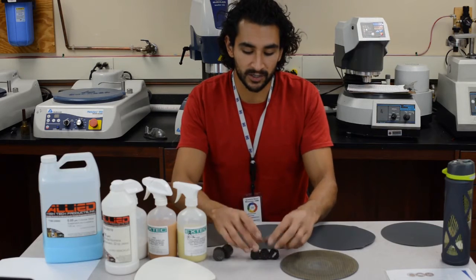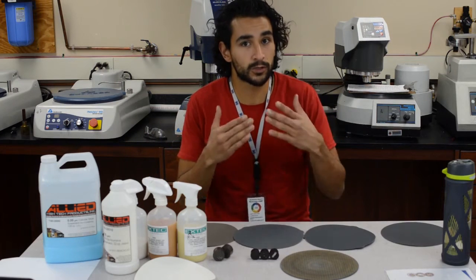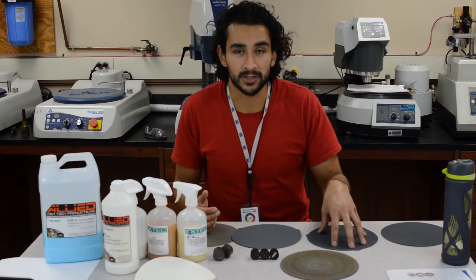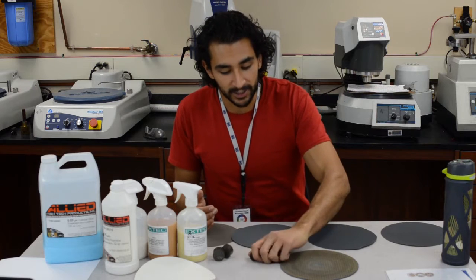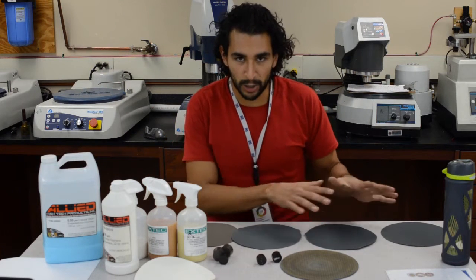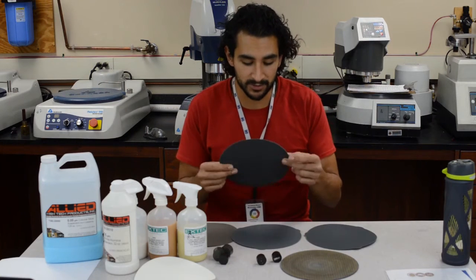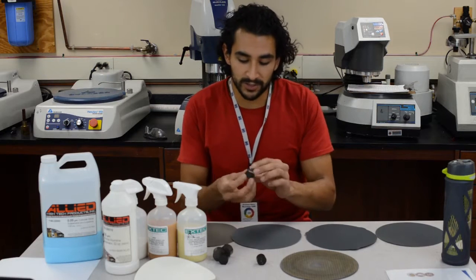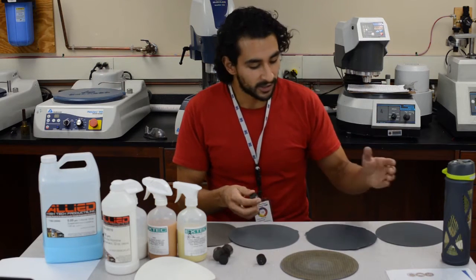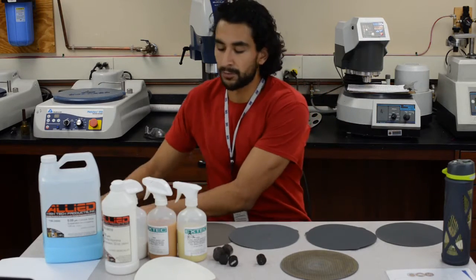We're going to work with these three first. Notice that I cleaned all my mounting material — make sure you clean off after you're done. Whenever you work in these labs, it's very important that you clean up after yourself. All I have here right now are the polishing materials. We have silicon carbide-based sandpapers, and what we're going to do is grab the samples and rub them against the sandpaper. I have several of them because they go from biggest particle size to smallest particle size.